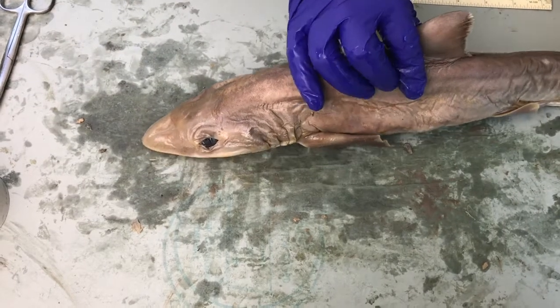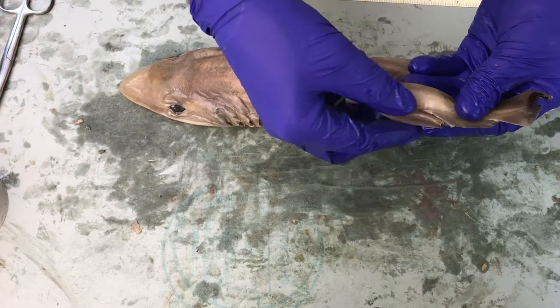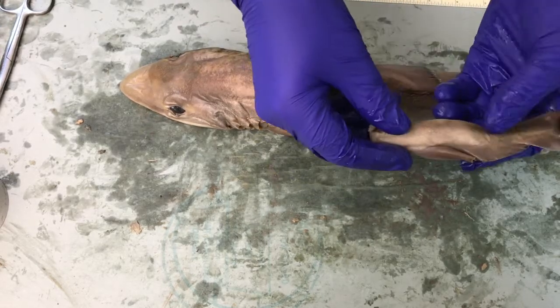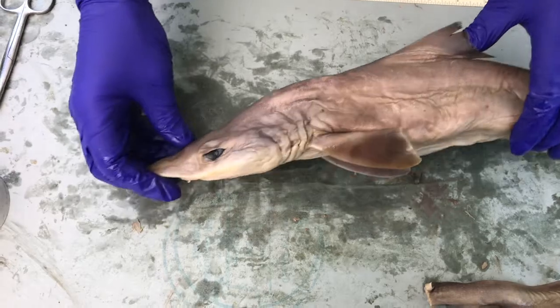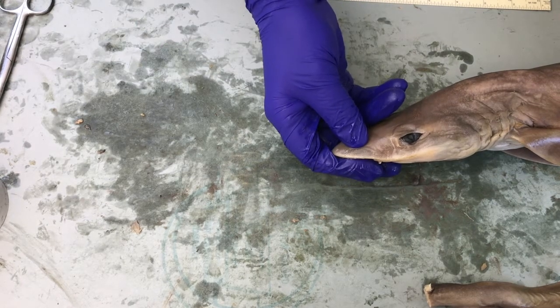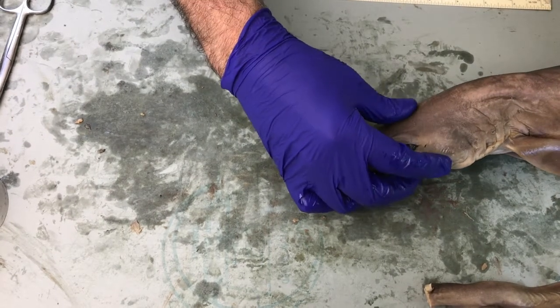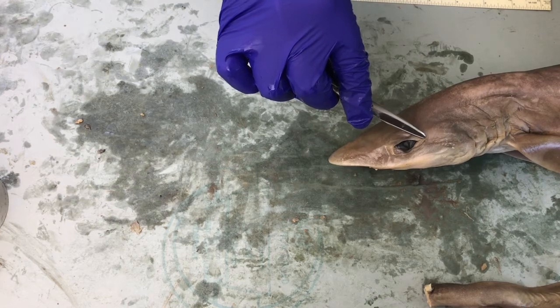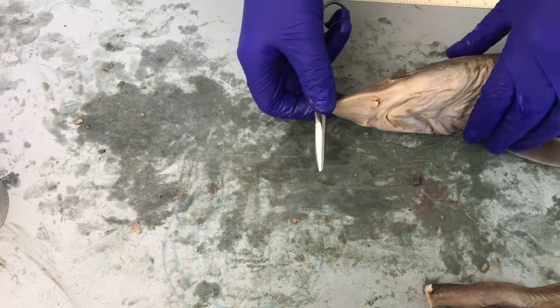Let's take a look externally. These guys come with the tail fin or the caudal fin cut off. It's of course a heterocercal fin, that is, the sides are unequal. The bottom is that little flap and the top kind of extends the spinal column into the top section there. I've got a nose. If I squeeze that, I can see a little pus come out of the pores leading to the ampullae of Lorenzini. Obviously the eye, and just behind the eye is a small spiracle, allows them to pass water, even when the mouth is closed, past the gills. Otherwise, water comes into the mouth through the gills.